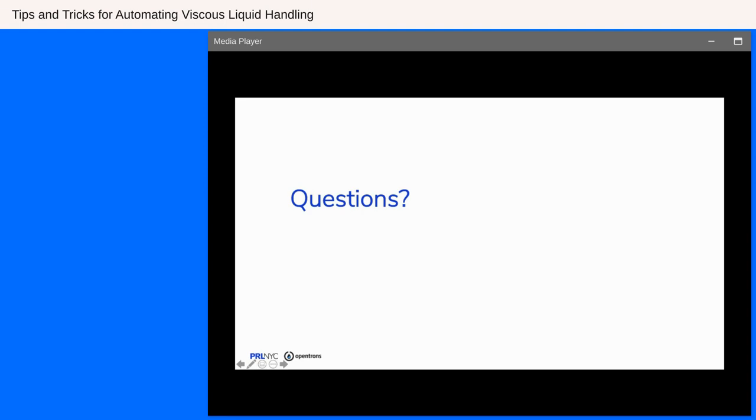Great, thank you. Next question. Could you speak on the touch tip function and how it can be helpful in dispensing viscous liquids?